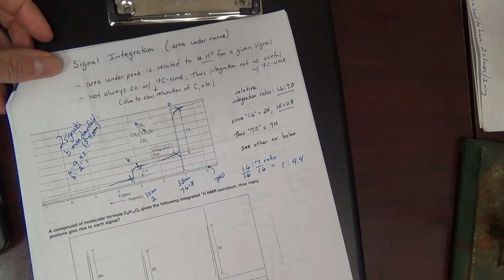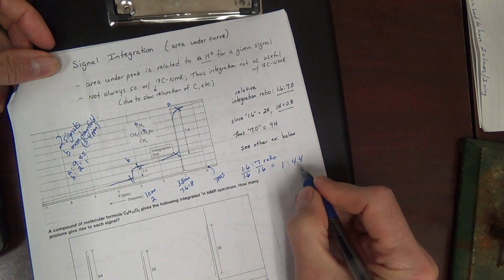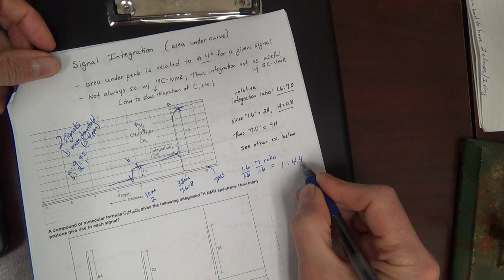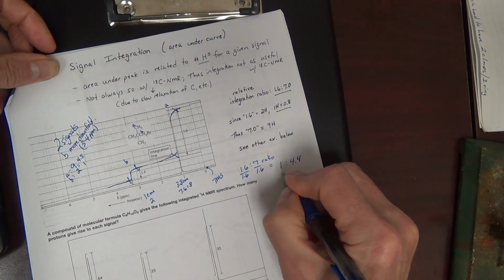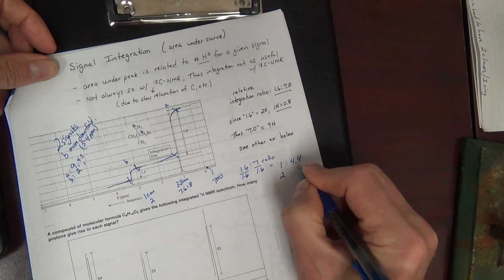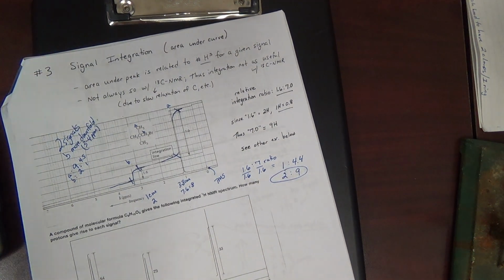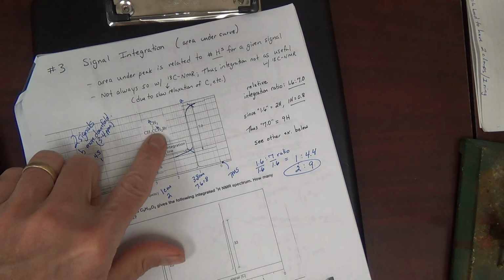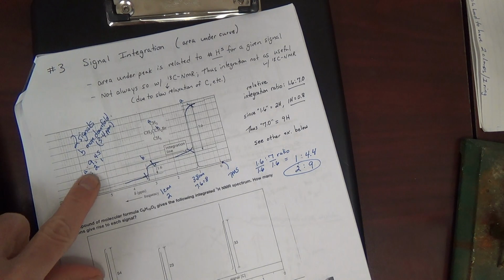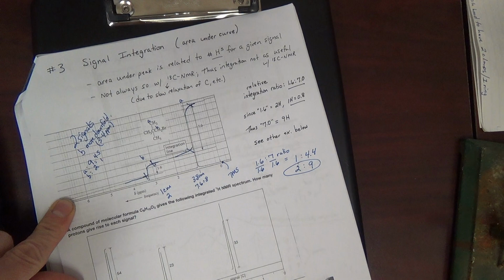At this point, this is a ratio of 1 to something. The problem is you can't have 0.4 hydrogens. And I'm guessing this is probably a half. Let's double this to 2, and if that was a half, that becomes 4.5 times 2, which is 9. And we get the integration, which is ultimately what we have. We have 2 B hydrogens, and we have 9 A hydrogens. Okay.